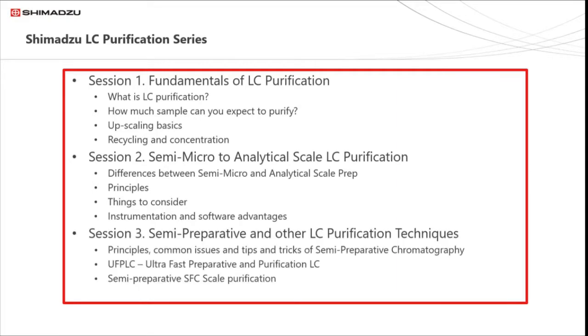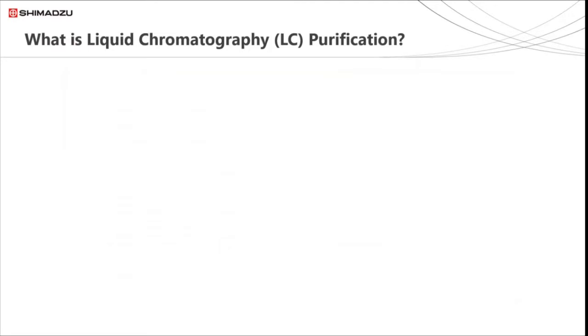Lastly, session 3, titled Semi-Preparative and Other LC Purification Techniques. This will cover principles, common issues and tips and tricks of semi-preparative chromatography, UFPLC, ultra-fast preparative and purification LC, and semi-preparative SFC scale purification. What is liquid chromatography LC purification?